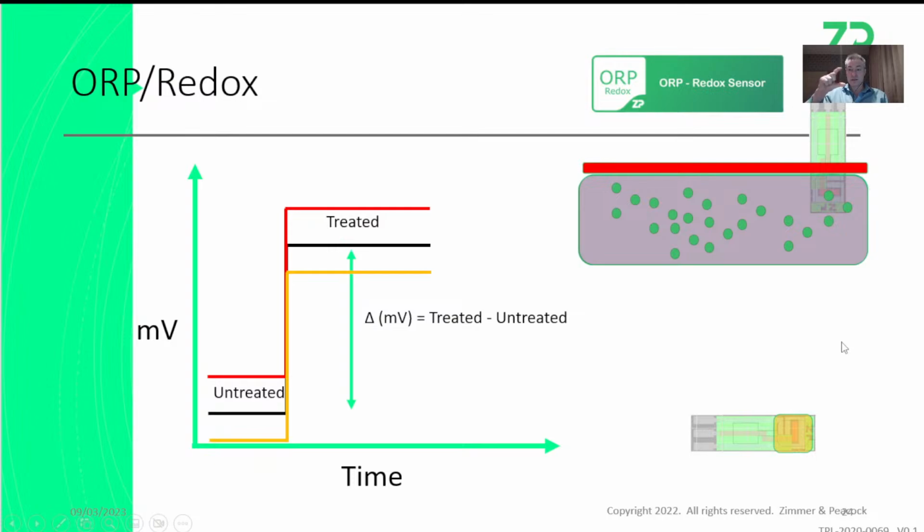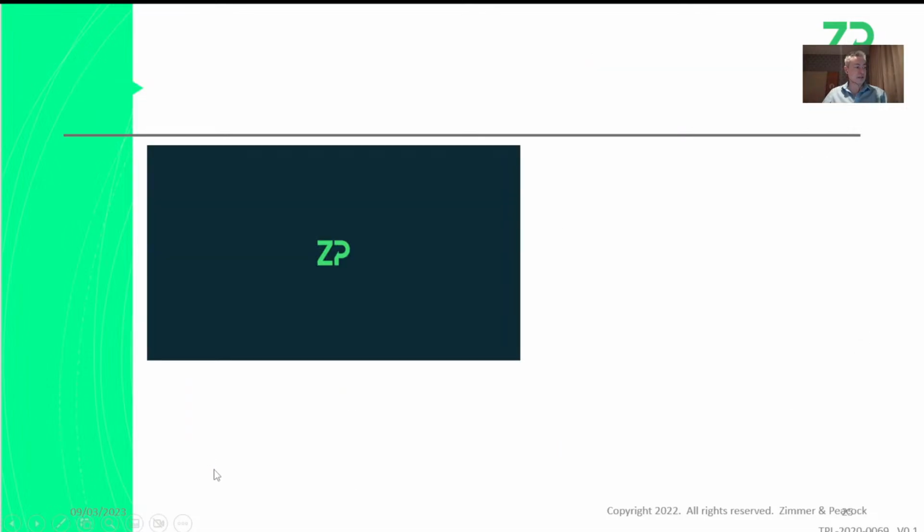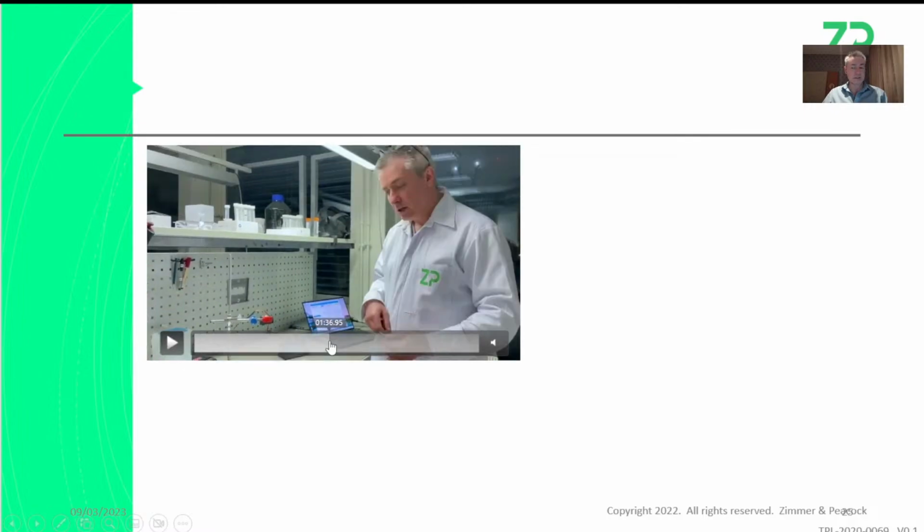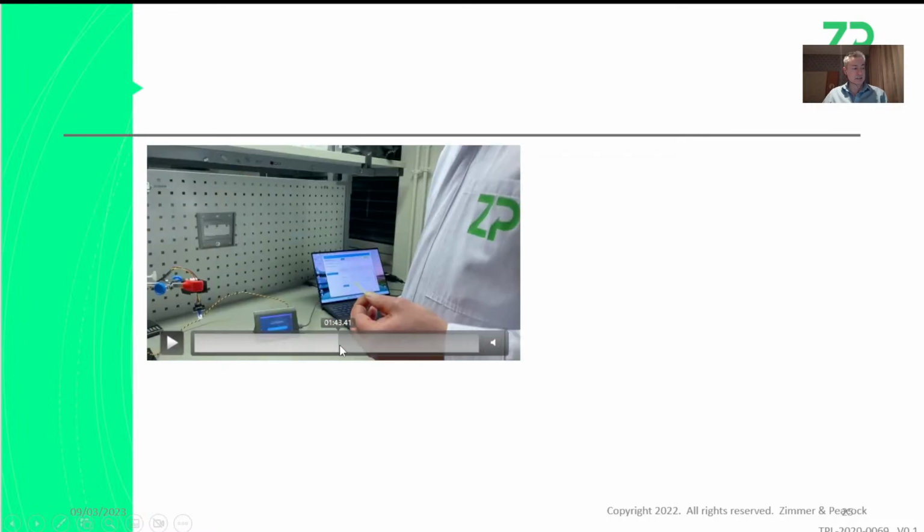I think the delta is the signal, but the baseline may be variable, and that's why one of the suggestions I make in a few slides' time is to use the multi-channel potentiostat, because we only need 30 microliters, for example, to cover our electrodes. So you can do 6 measurements and get a more statistically accurate answer on these numbers. So it's the same as earlier on, that I do suggest 6-channel potentiostats.